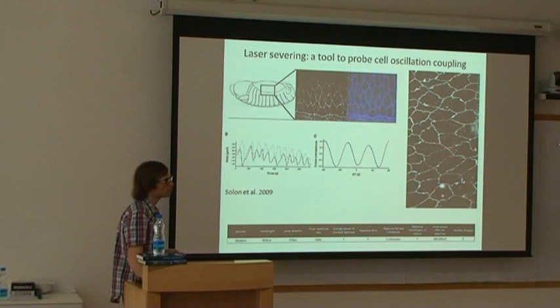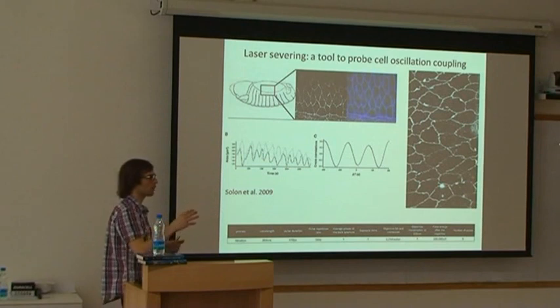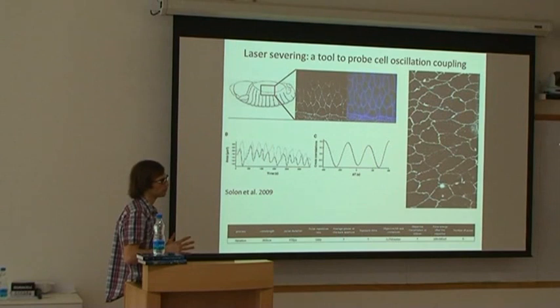At the most, yes, because it could be that I'm still bleaching on the borders, because normally you have a Gaussian-shaped beam. So I cannot say how much I am bleaching within the spot. So at most, the one that I measure is 400 nanometers. The damage is restricted. The plasma is very, very small, it's tens of nanometers.